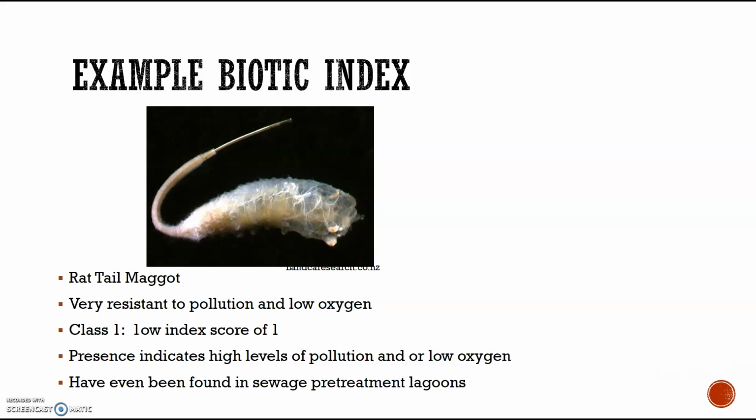I once took an aquatic insect identification class, and we had found a few of these. Most other insects, you can put them in ethanol and they die within seconds and will be preserved. These guys, we had to drop them in formalin, which is basically formaldehyde, and they would still persist for like half an hour. They're pretty tough.